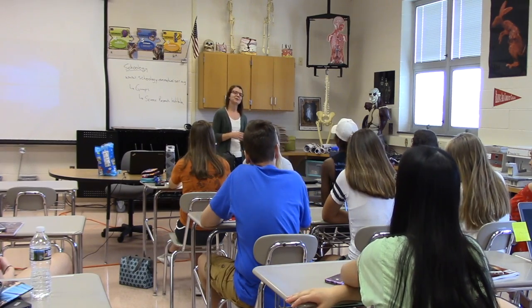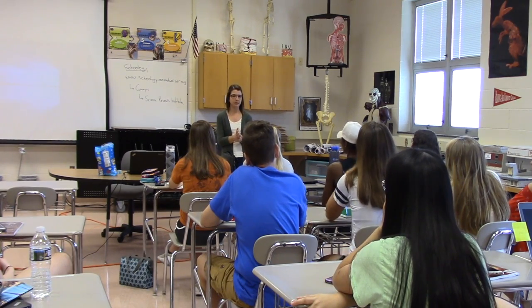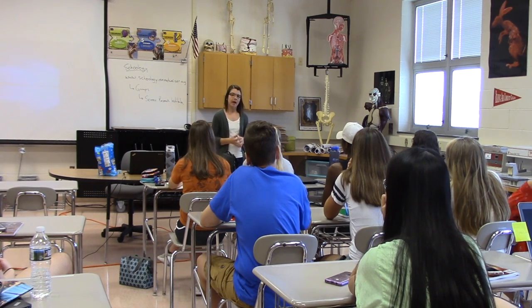So as far as your experiment goes, using the liquid from poison ivy or whatever you were saying, on mammalian cells, the way we would test something like that is we would seed 96 well plates with, do you guys know what those are? Yeah? Okay, sorry, I'm not too familiar with what you guys are doing and what you aren't. So we would use a 96 well plate, and we would seed our cells directly into that plate. So instead of putting them in a flask, we would put our cells directly into those 96 wells. And then we either do drug dilutions.